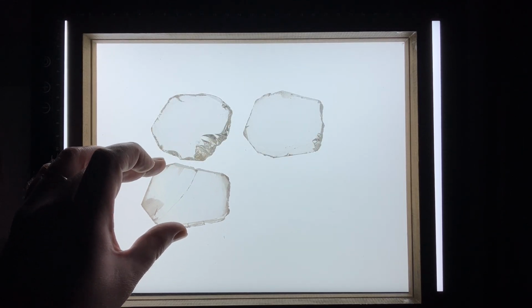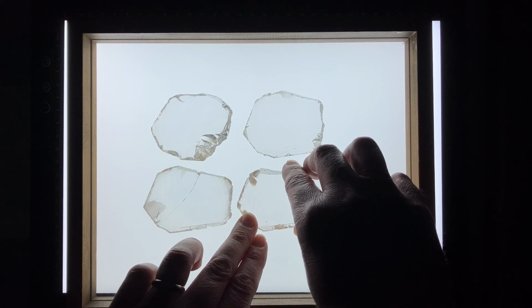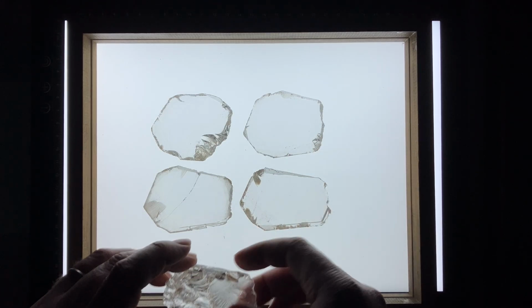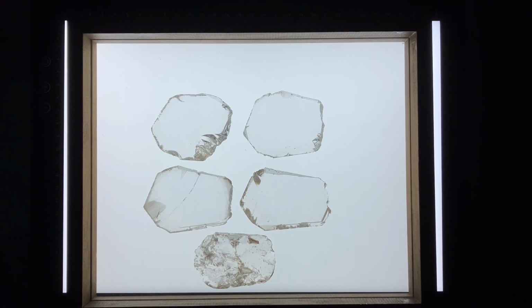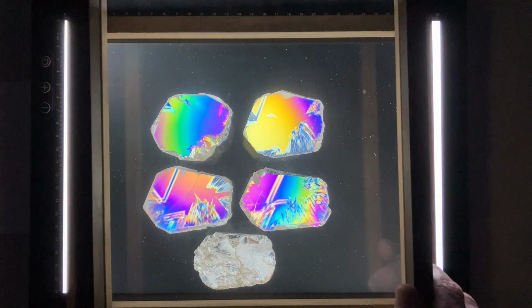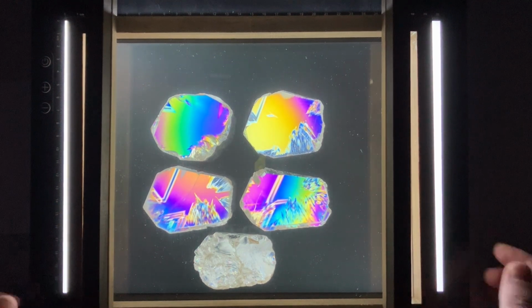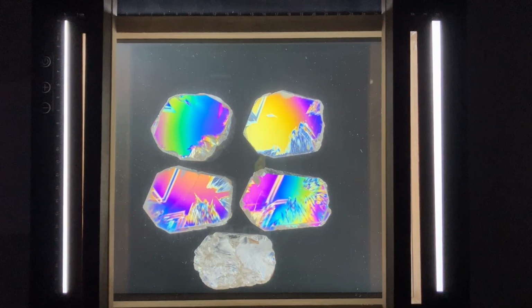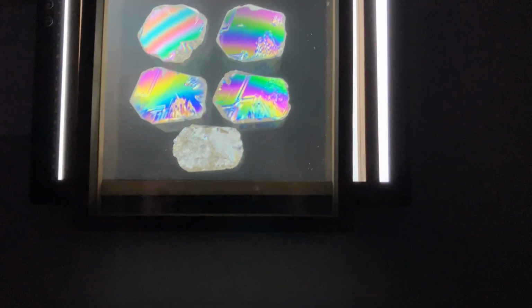However, you can see with our view of transmitted plane polarized light that not really too much interesting is going on with this quartz crystal. It's pretty much just clear. That is until we bring in our upper polarizer and can then explore the optical activity of our quartz along with the Brazil law twinning in this quartz. The thickness of each of our quartz slices is going to determine the color that we end up seeing due to that optical activity. Except where there's Brazil law twinning occurring in our quartz crystal, messing with those spiral staircases in our quartz, and then how that plane of our plane polarized light is rotated.